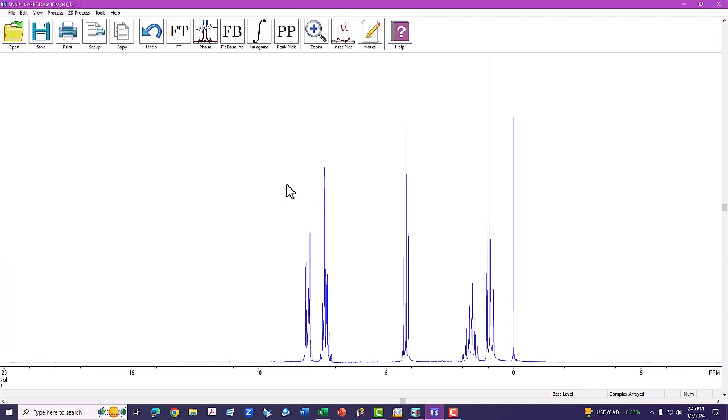As time goes on and we start losing coherence, the peaks get a little broader at the base, and it just doesn't look as good. So those last two data points that you see during the curve fitting, they don't always fit. So don't be too surprised that you don't get a very, very good fit.